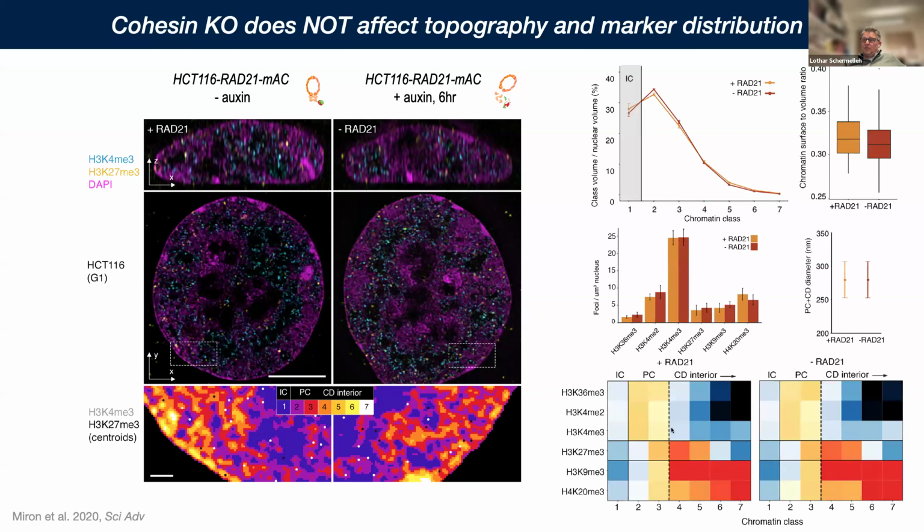So you really can see how reproducible marker distribution is, and that gives an indication that Hi-C and the domains that are derived from that are not exactly physical representations of a physical domain, but really an epiphenomenon of the averaging of large populations.